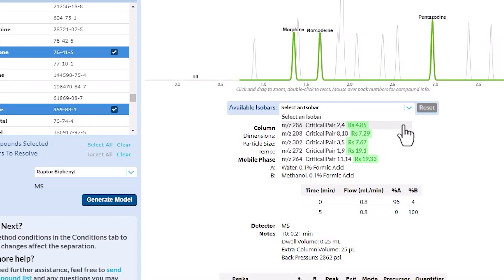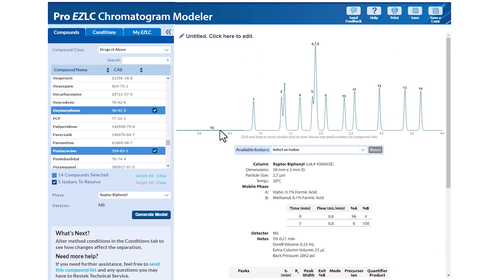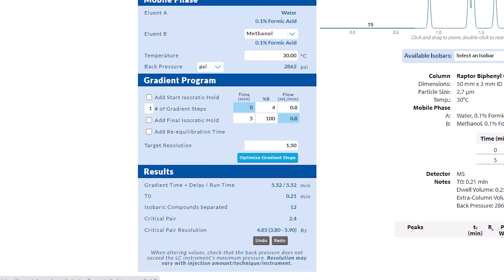The resolution of all critical pairs is above the accepted value of 1.5, giving us an opportunity to shorten our model's runtime without sacrificing separation. In the conditions tab on the left, you can optimize your separation by choosing column dimensions, inputting any volume effects, changing your mobile phase, adjusting temperature, and editing your gradient program.